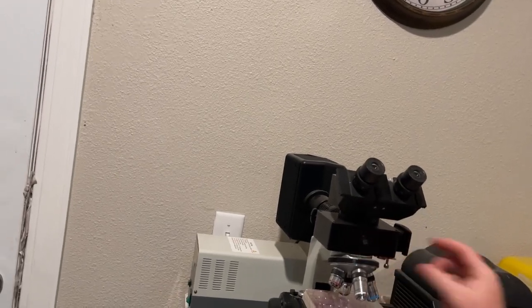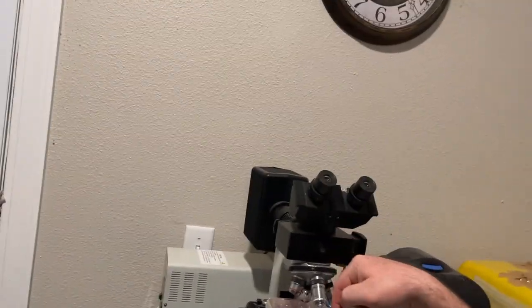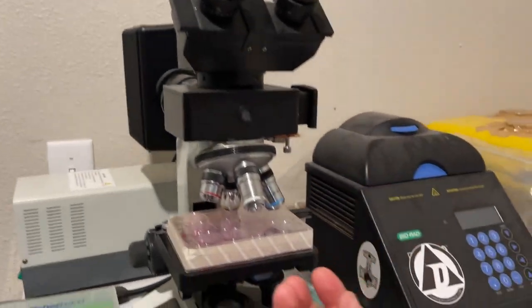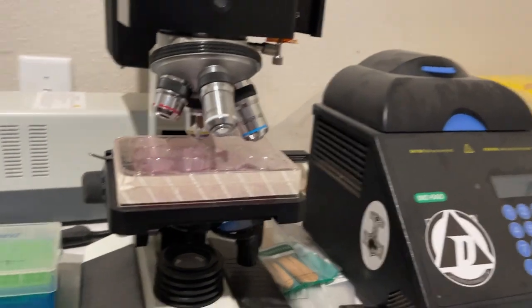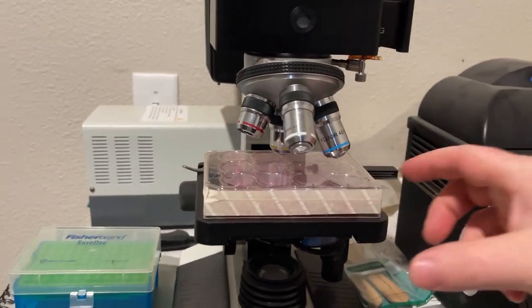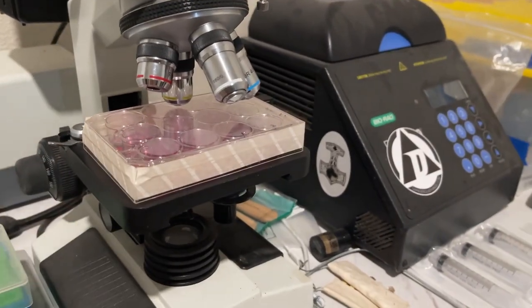Inverted microscopes, this piece is under the bottom, the light source is on top. What you end up with is the ability to look at the bottom of the plate. And that's really nice. That's what you normally use for tissue culture in flasks like this.